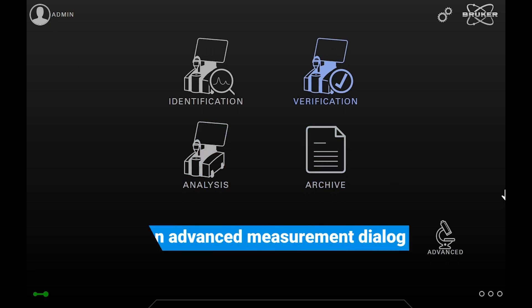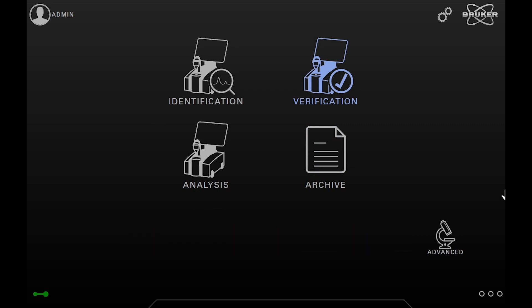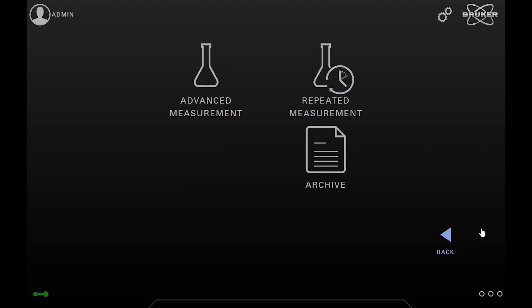Now you can open the Advanced Measurement dialog that is typically located on the second page of a home screen. To get there, use the Advanced button in the lower right corner. Then touch the Advanced Measurement button to open the dialog.